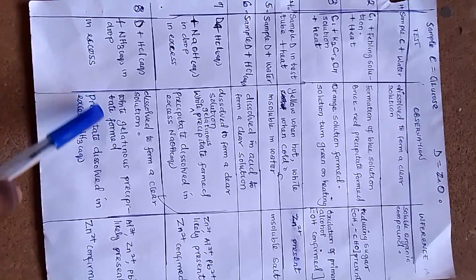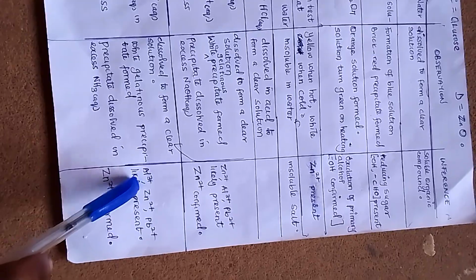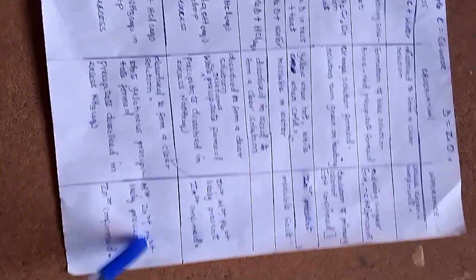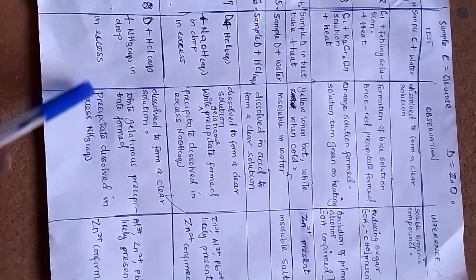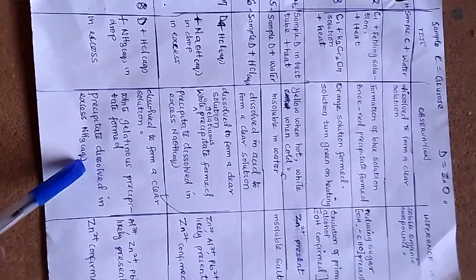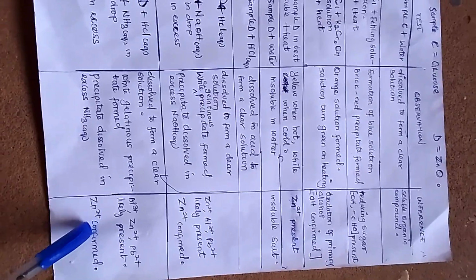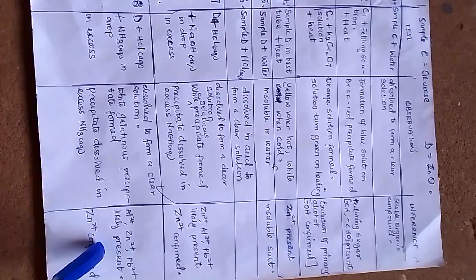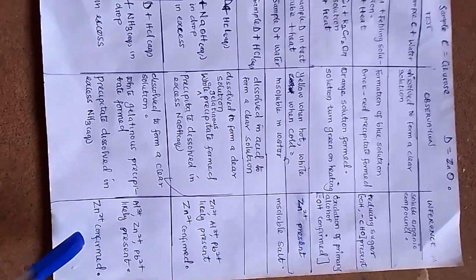If you now put ammonia, we also have a white gelatinous precipitate form. And remember, there we have aluminium, we have zinc, and we have lead ion likely present. In excess ammonia, the precipitate dissolves. When the precipitate dissolves in excess ammonia, it is only limited to zinc ion. With aluminium and lead ion, the precipitate does not dissolve in excess ammonia. It is only zinc. So that is why you are going to put zinc confirmed.